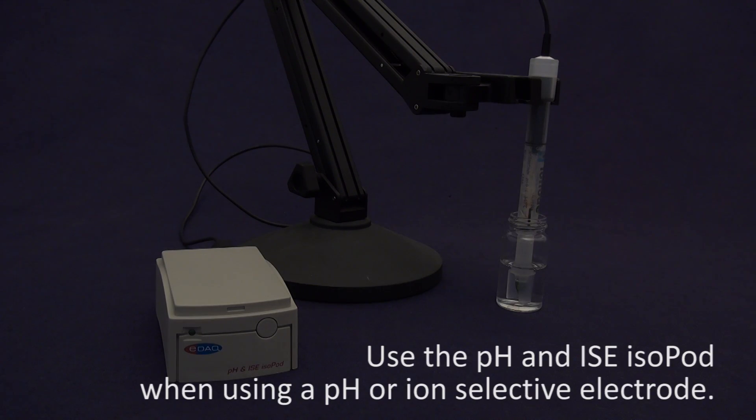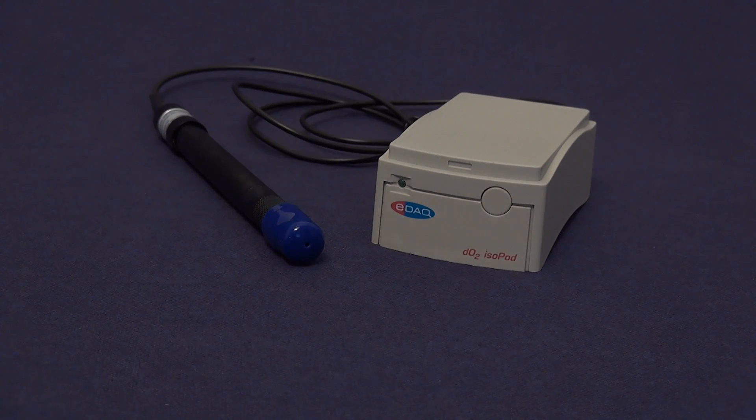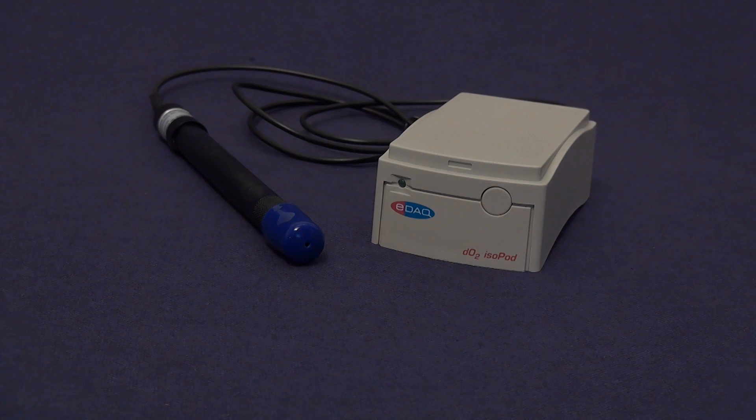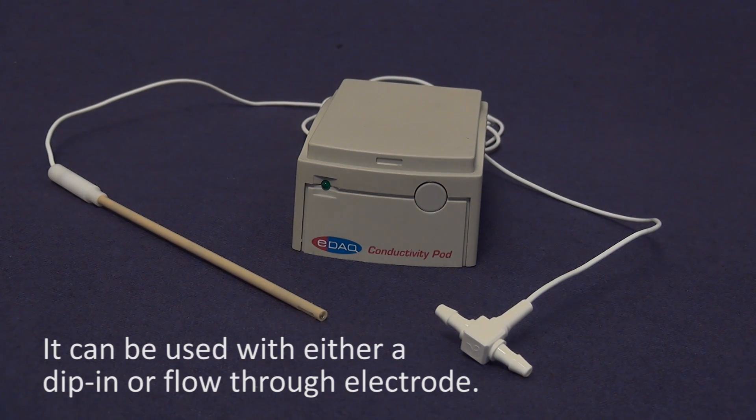Use the pH and ISE isopod when using a pH or ion-selective electrode. The DO2 isopod is for monitoring polarographic or Clark dissolved oxygen electrodes. This isopod monitors solution conductivity with a two-electrode probe, and can be used with either a dip-in or flow-through electrode.